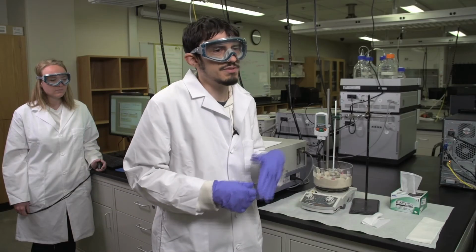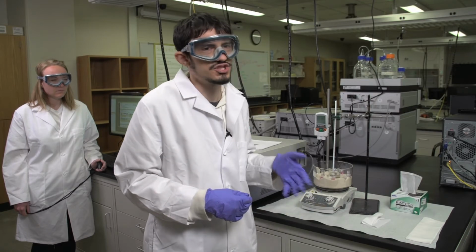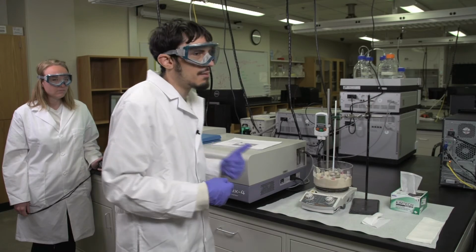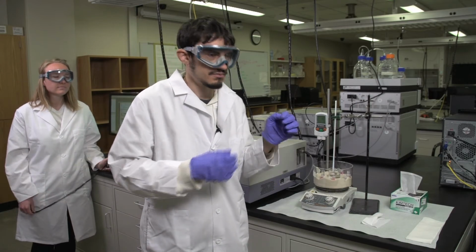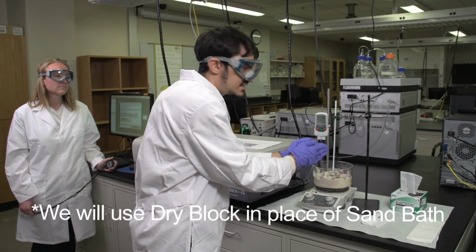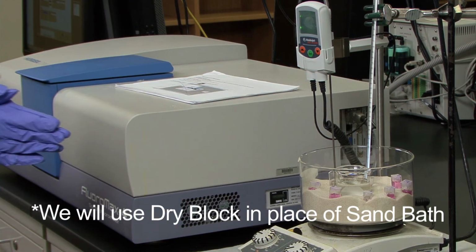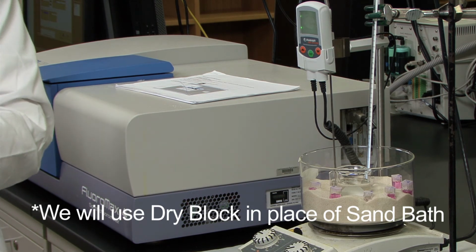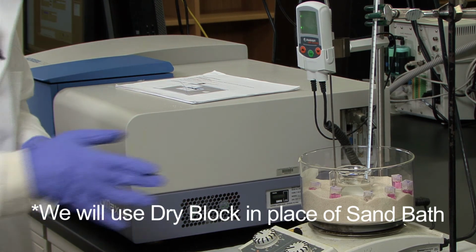Since temperature loss can be rather rapid, and this is a highly temperature-dependent experiment, have your lab partner utilize a stopwatch to time exactly how long it's going to take to get from the sand bath to the fluorimeter to make the measurements. You'll want to make sure it's as consistent as possible so that the data is good.